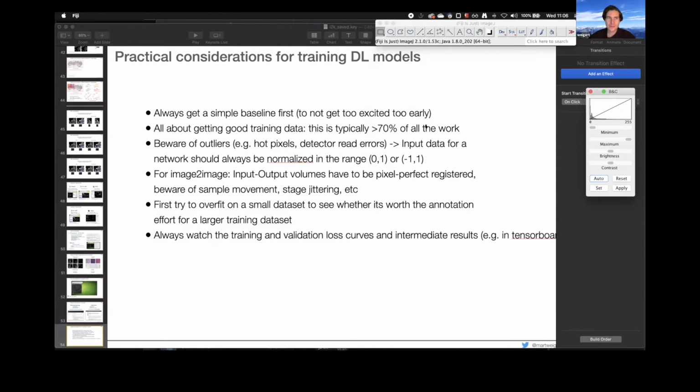This you can do. I mean, this is an approach that in theory should work. The only problem is the aspect that you correctly mentioned, that you have to make sure that your segmentation mistakes are randomly distributed, right? And typically, especially for crowded objects, they always fail consistently at those crowded cases, right?